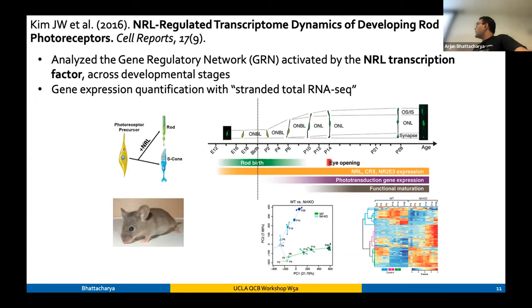Yeah, so as far as I remember from this paper, you can read the paper, but it's just showing the broad scale: within the first two PCs, you can pull apart the full transcriptome, which shows widespread changes and deviation in the first two principal components, between the wild types and the knockout of whatever transcription factor they were interested in. And same thing here, you can see pathway changes across the different modules.